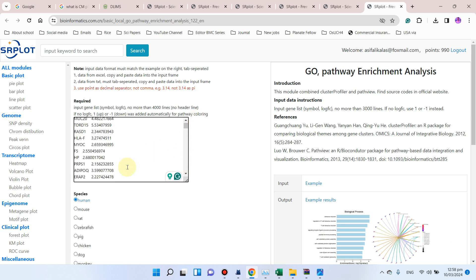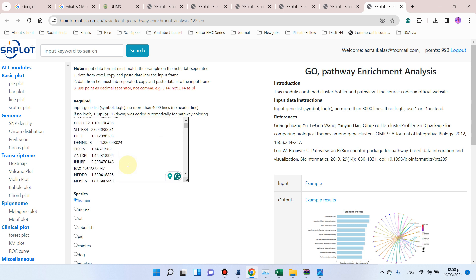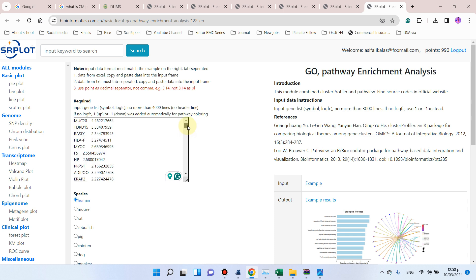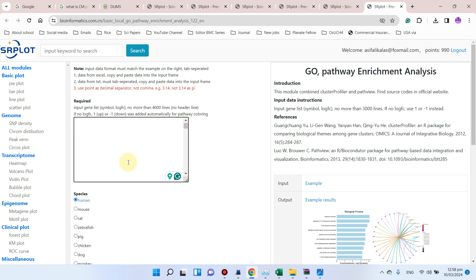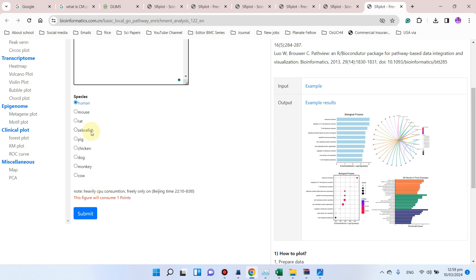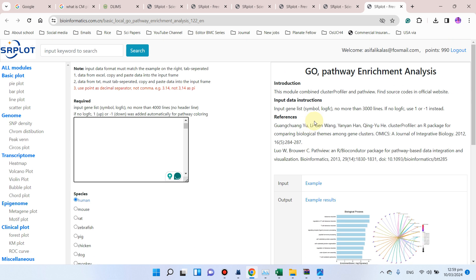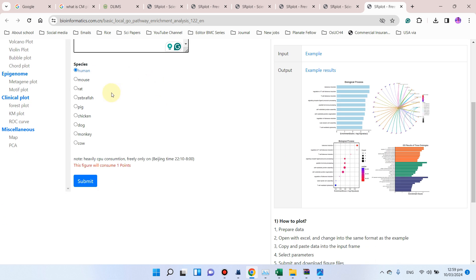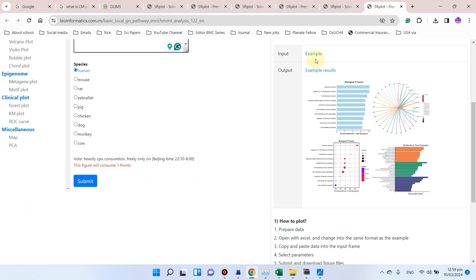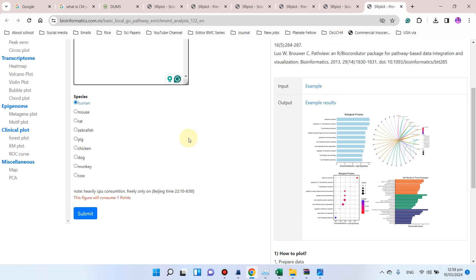You can see here we have just pasted all those genes along with their FC value. And here you can see we can now select the species of those genes, and this gene ontology pathway enrichment analysis is only available for following species.